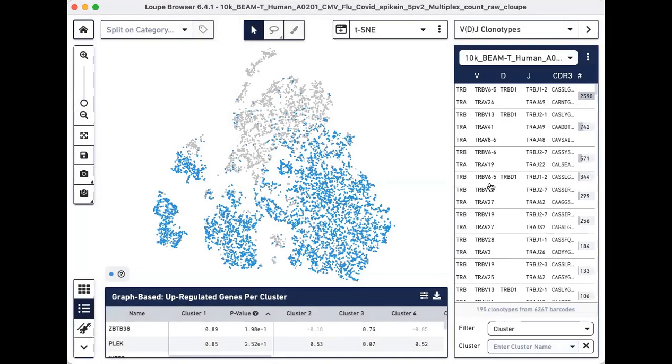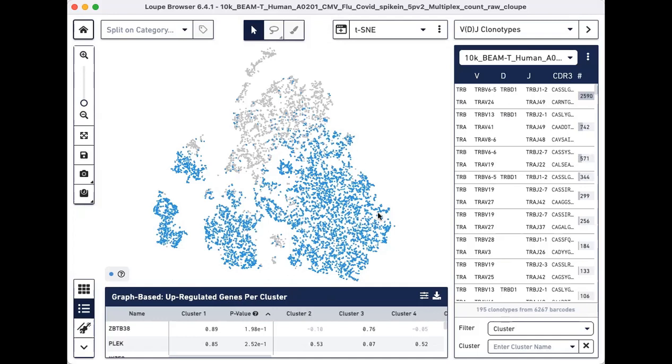As you can see, all VDJ Clonotypes that were present in the V loop file are now listed on the right panel. The T-SNE plot has also changed. Only T cells are now colored in blue.